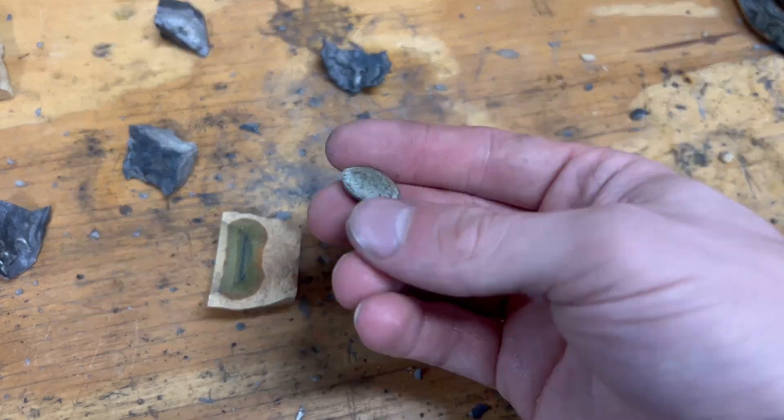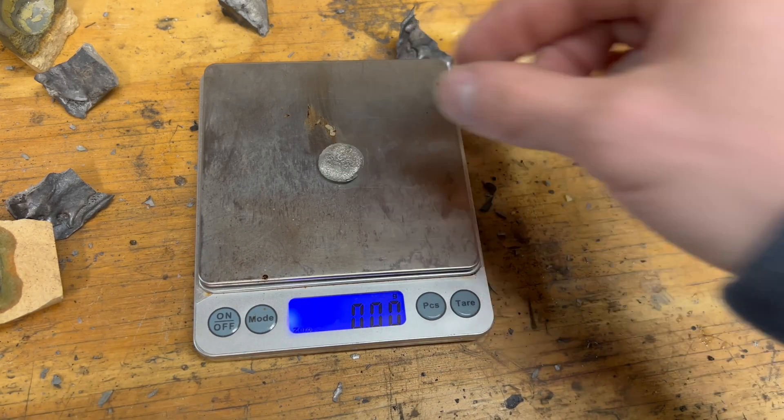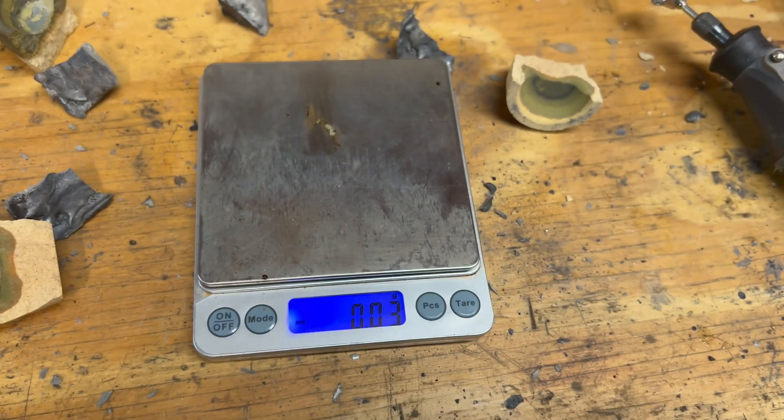Now let's see the results. We can crack open the cupel and our final weight of silver is seven grams. That's another element checked off the periodic table — on to the next one.